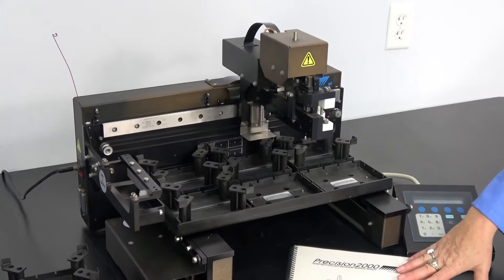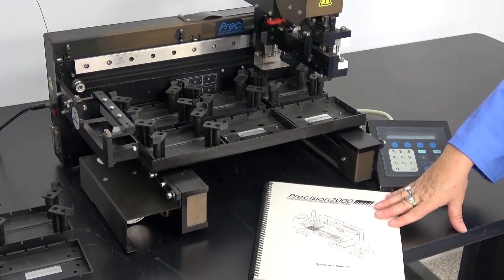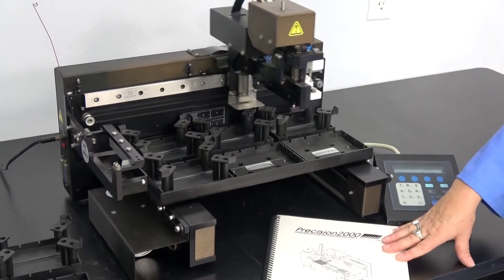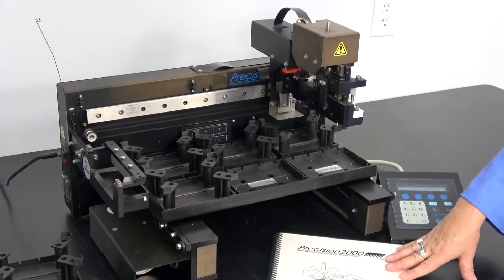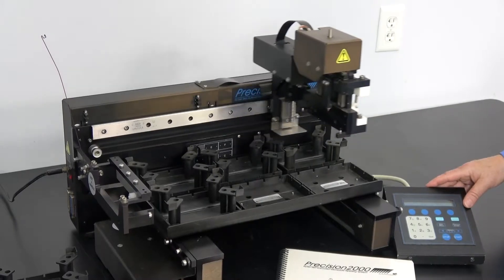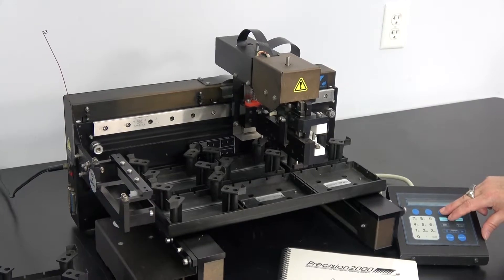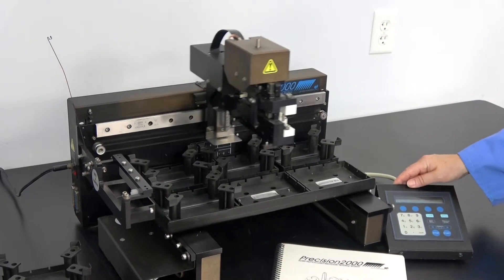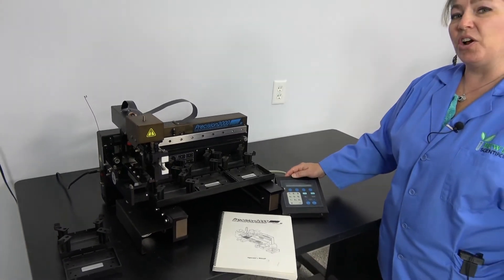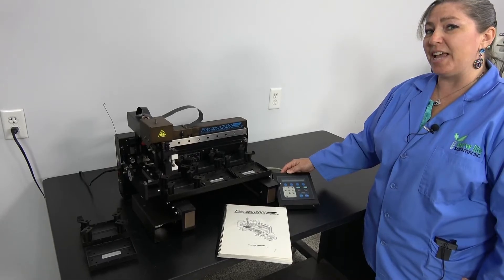We do have the manual for this particular instrument, and it does go along with its purchase. This particular item has been thoroughly checked out by our in-house technicians and is on hand in our Cridersville, Ohio facility. It is backed by our 90-day warranty.